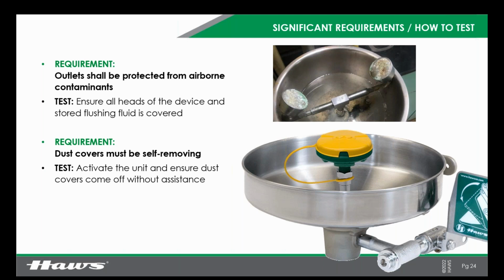The dust covers also have to be self-removing. Upon activation, they have to pop off completely on their own, and it cannot take any additional assistance to remove the dust covers. It has to be automatic.